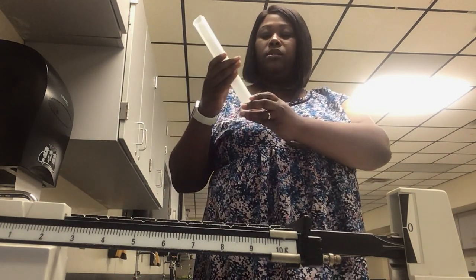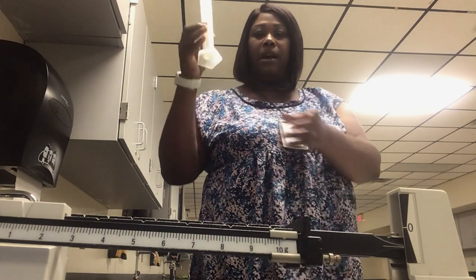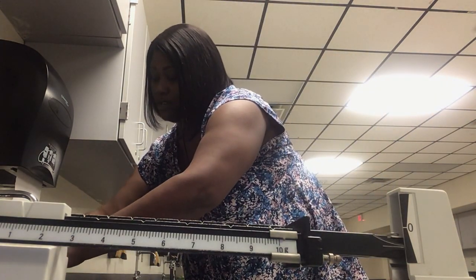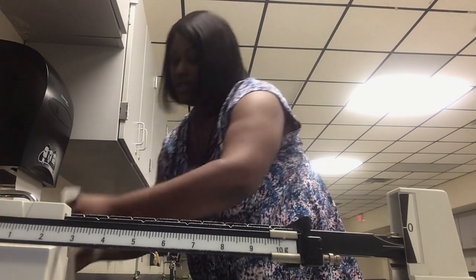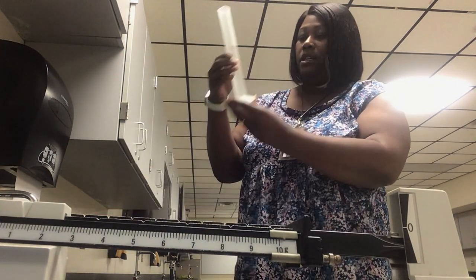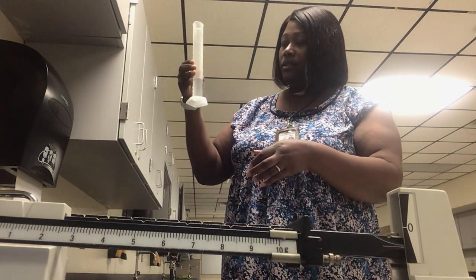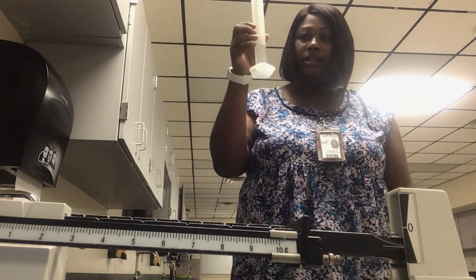So what we're going to do is, a good number is probably about 40. So I'm going to come to the sink here and I'm going to fill my graduated cylinder up to about 40. I have a little bit too much, so I pour that out. All right, I didn't do 40, but this is 30.